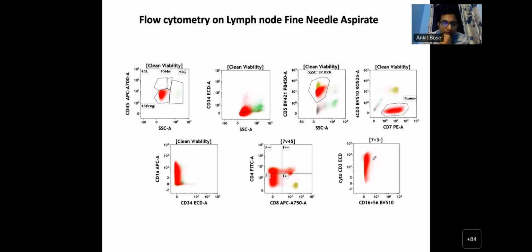So these red cells, on the CD34 and side scatter graph, that is the second plot, we can see that CD34 expression is very much diminished. Yeah, it's negative. And CD5? CD5 is positive. I will not say increased, because you can see these yellow cells are normal T cells. As compared to that, this looks dimmer, but it is positive. Then CD3 is diminished. And CD7?